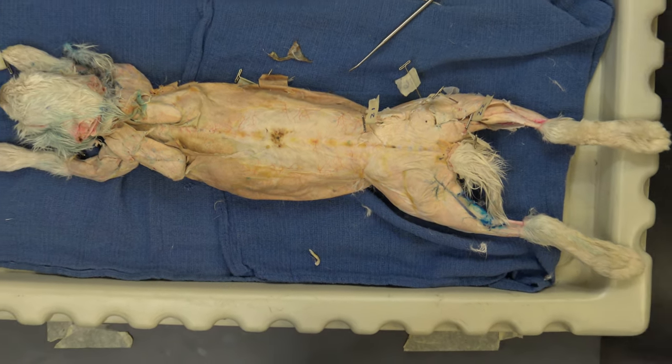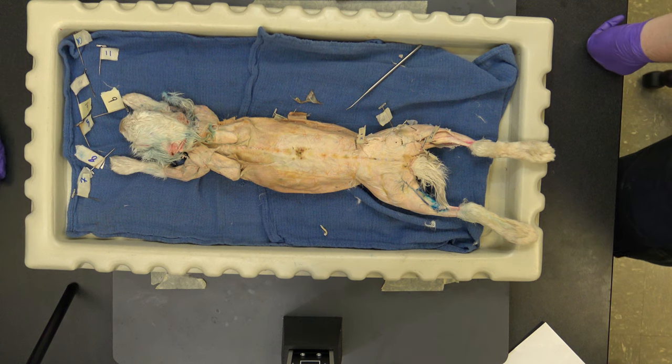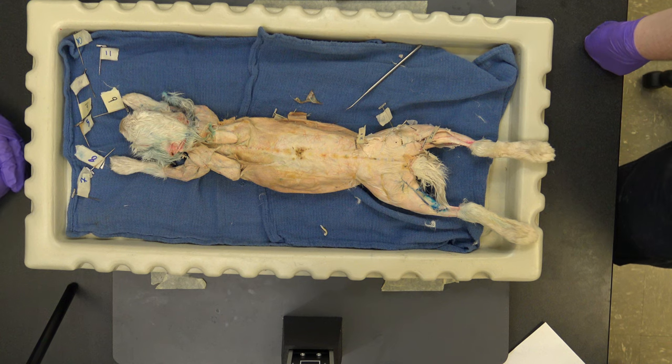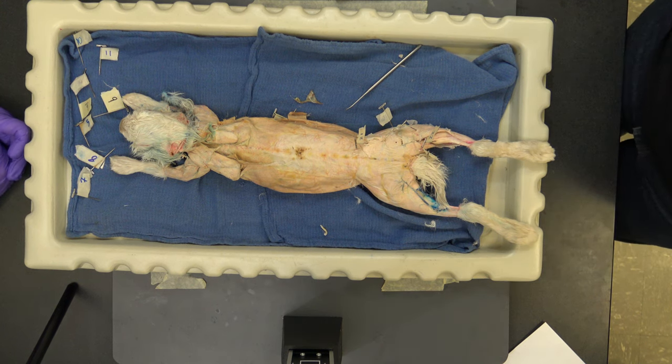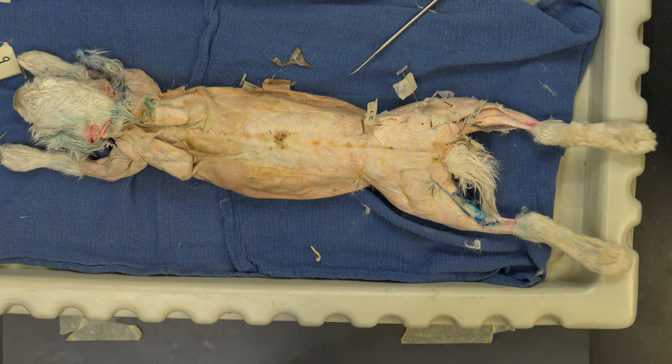That is the overview of the 22 muscles you're going to need to know. There is going to be a quiz associated with this video and the previous video — we're going to call this one 1B or something. Questions will be based on the lab manual and these videos, with some images as well. That's going to be your points for lab. You will still have a lab exam in a similar format to the animal part, where you'll have photos of anatomy and need to tell me what you're looking at. The only things I'm going to ask you are the 22 muscles we have here.